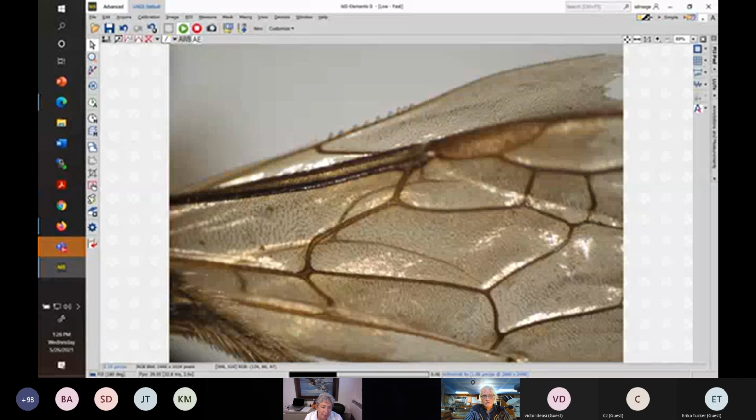So if you look, this is straight and there's this sharp curve at the bottom. The alternative is not a simple straight line, because nature doesn't do straight lines a lot of times. So often what you'll see in a non-halictid group is that this basal vein is going to do some kind of slow arch up there.